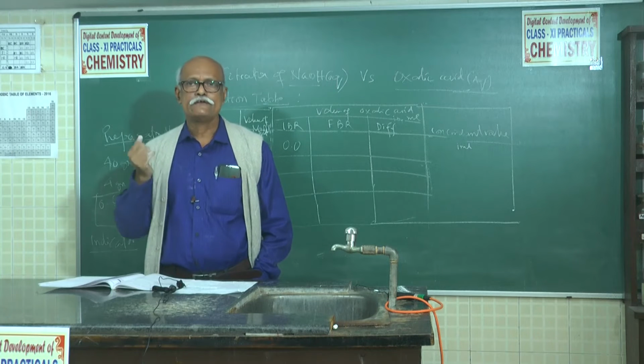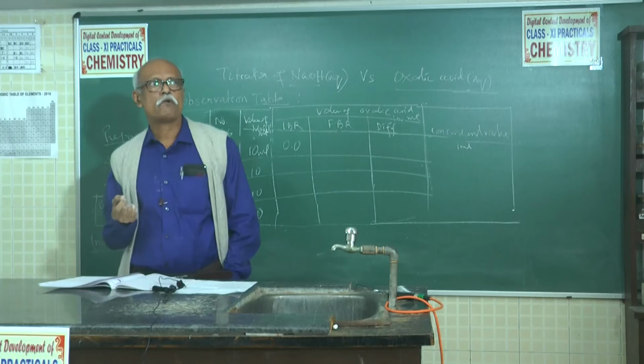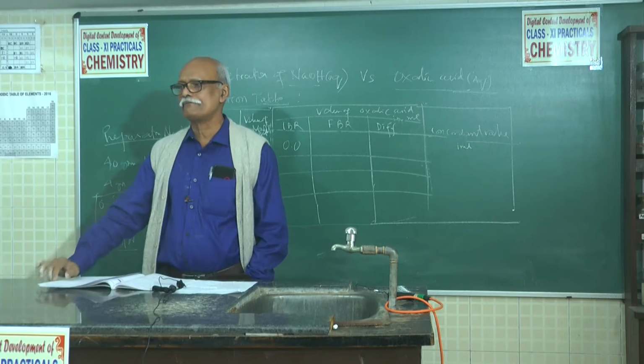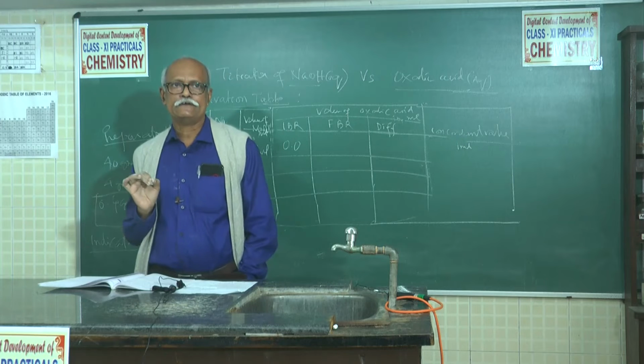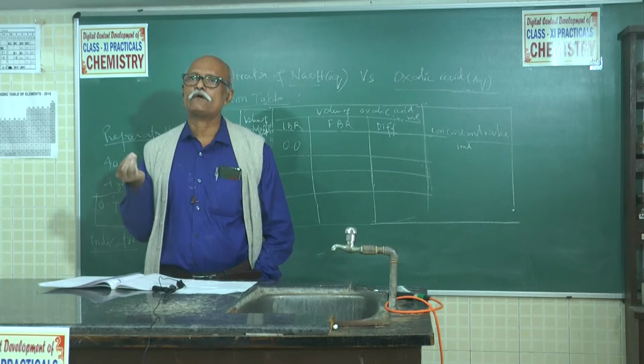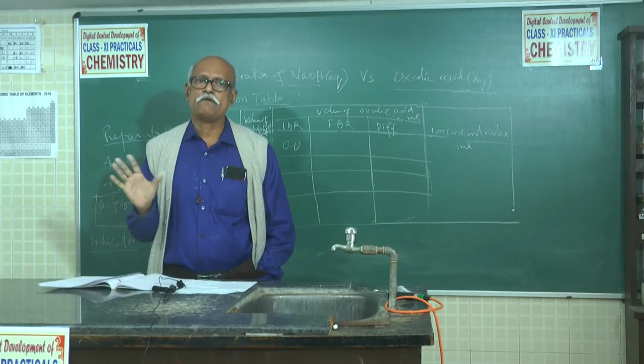Subsequently, after some days it will be converted into sodium carbonate. The upper layer of the sodium hydroxide may also contain some portion of sodium carbonate. So as it is not a stable compound, being hygroscopic and combining with other compounds, it is not taken as a primary standard.